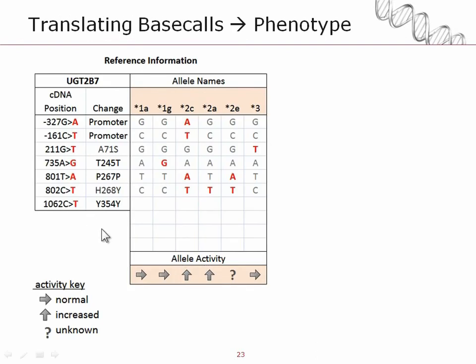What is allele translation? It helps to start with the reference information that's available to DMET console. I picked one particular gene, UGT2B7, which has seven markers. In addition to that we have defined star allele names. A star allele name is actually a pattern of genotypes across the markers that are used to do naming.